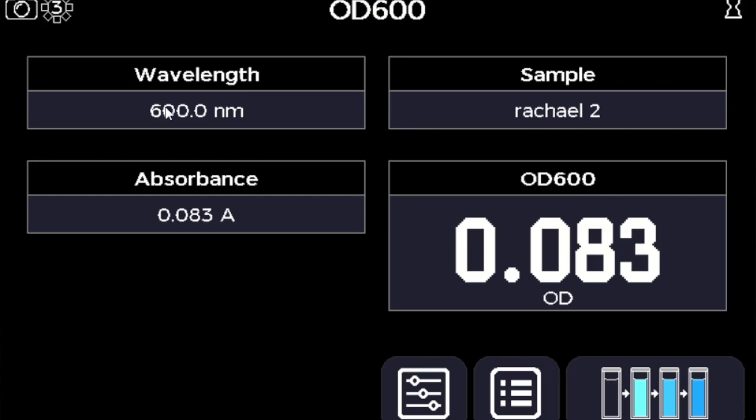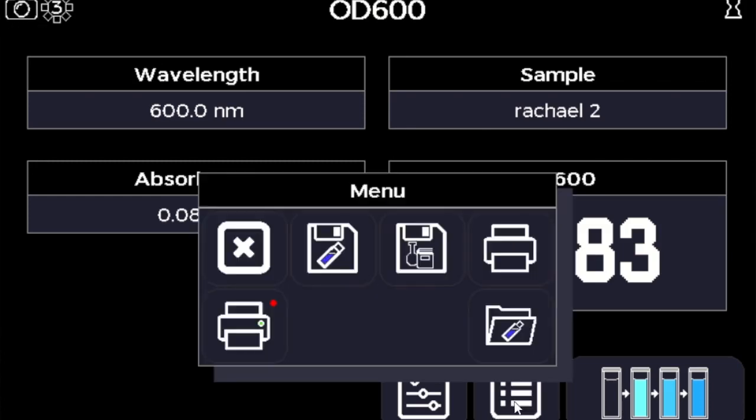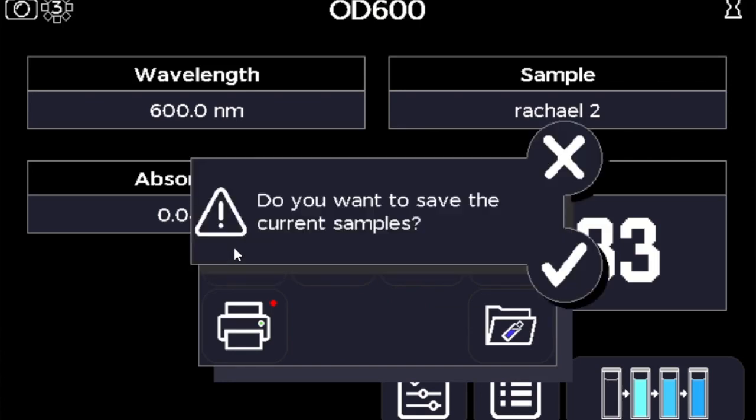My favorite feature is that little camera icon up in the top corner, which allows you to take a screen grab of any result screen you have within the instrument.